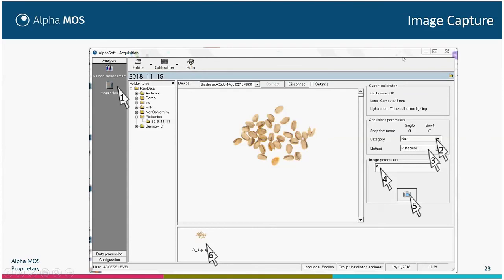When you have created your method, you can capture images. Go to Acquisition, then set the acquisition parameters: the category, the method name — which automatically sets the zoom parameter — and the sample name, then click Acquisition. We advise doing some replicates of the same sample by moving the sample or placing another sample to take another acquisition. We advise at least three acquisitions of the same sample. You should not put a different name for different replicates; the system will automatically add a number for each acquisition.